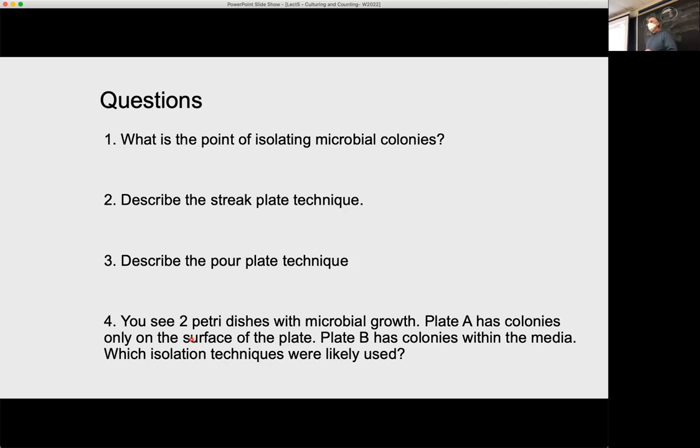Sanitize it again, another quarter of it, make more streaks, sanitize it again on a different quarter of it. As long as they're all connecting, fine, and then sanitize again, and streak right away. Yep. Or more. Yep, that's the way to go about doing it. Thanks.